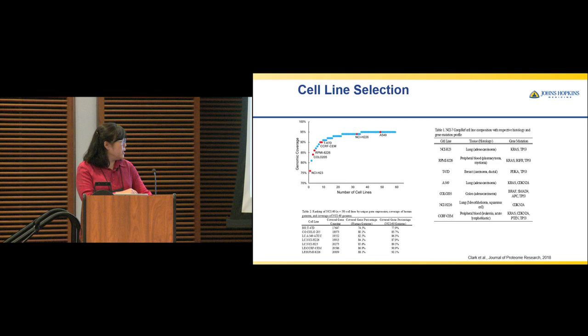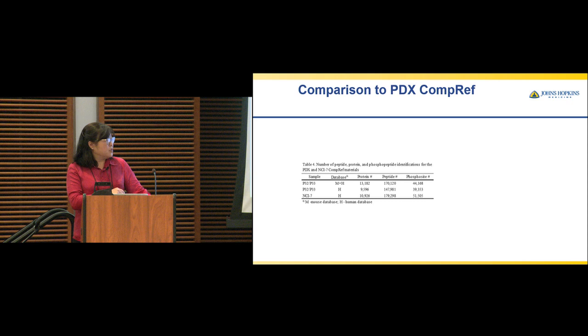So using this material, we actually expect to cover most of the cancer proteome or genome to give us the quantitative value for the tumor proteomics analysis. So this is a comparison of the two reference materials. One is this CompRef material from xenograft.